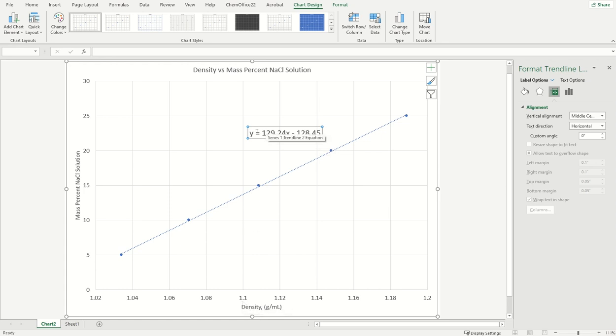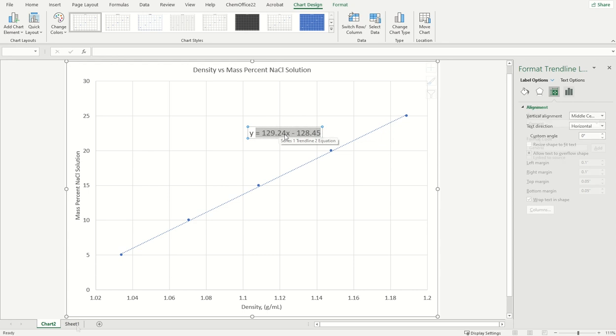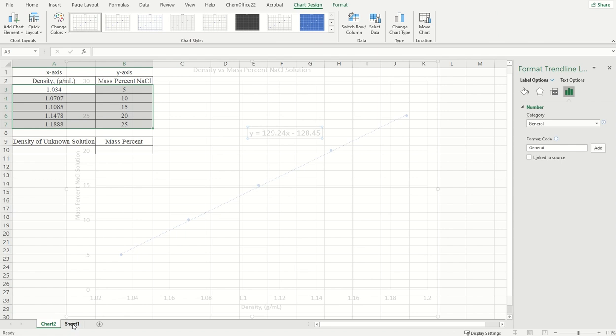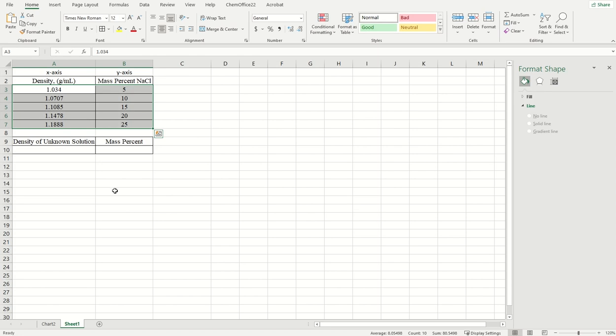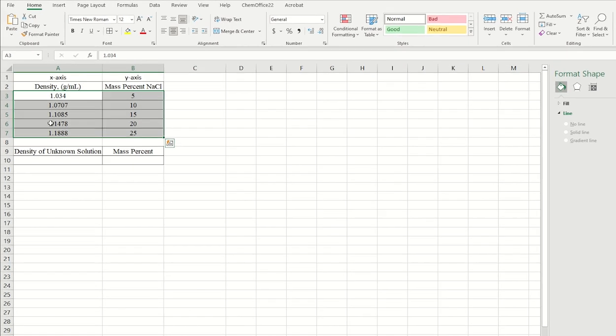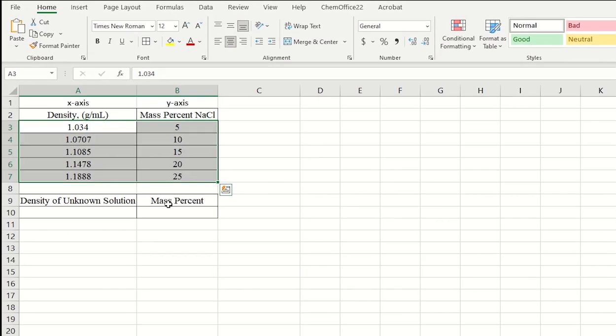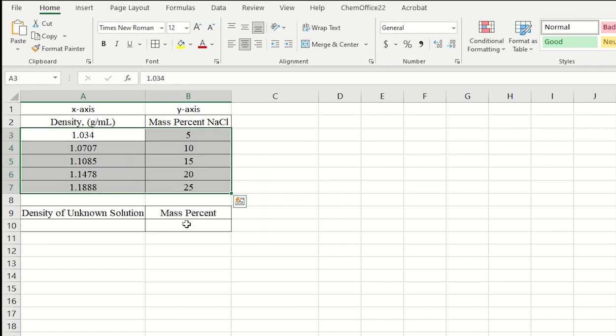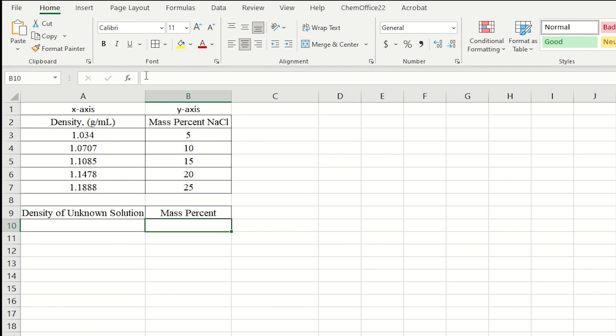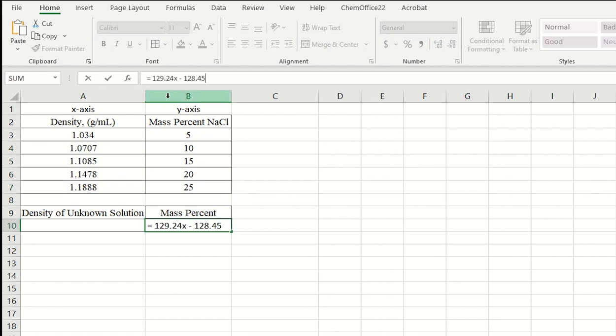And so what I'm going to do here is actually highlight this section and copy it. You can Ctrl-C on a PC or Command-C on a Mac. Let's go back to our original data. And I'm going to plug that into this section. Y is equal to, and I'll go ahead and paste that here. So there's my equation.